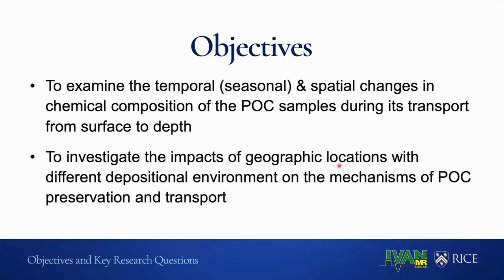Okay, the objective of the study: we want to examine the temporal and spatial changes in chemical composition of the POC samples during its transport from the ocean surface to depths, and to investigate the impact of geographic locations with different depositional environments on the mechanism of POC preservation and transport.